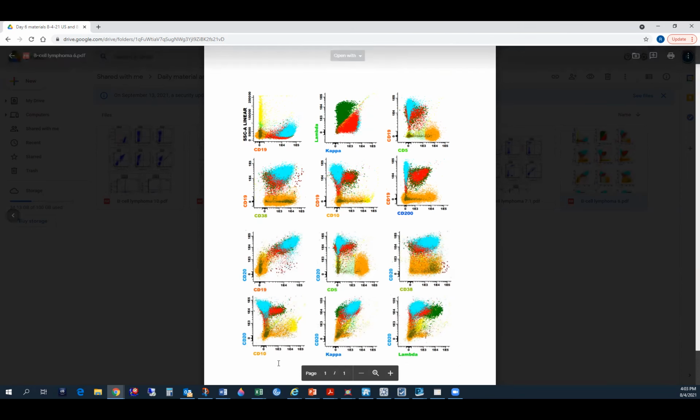Then when we are doing its kappa to lambda, I was between kappa skewed versus kappa restricted because I'm more used to those lines that help me here. But I think it is kappa restricted, but I just wanted to make sure it's not skewed, because they were kind of very close. But if I was to interpret, I would say restricted.